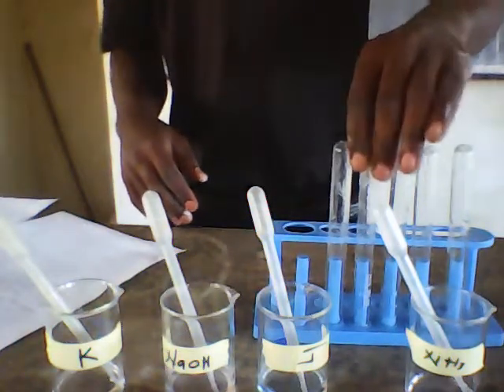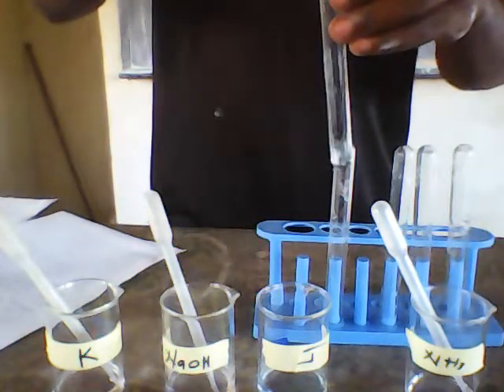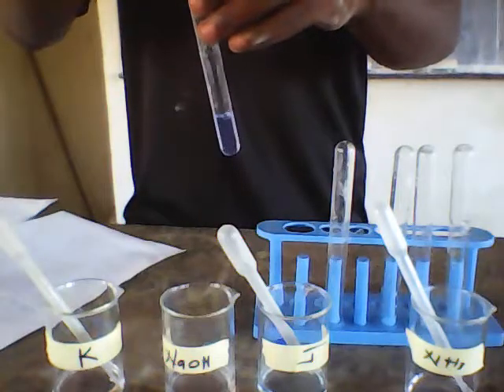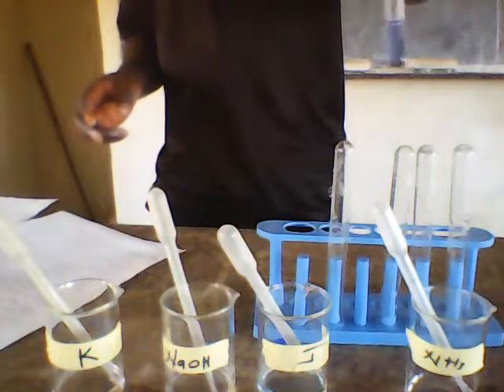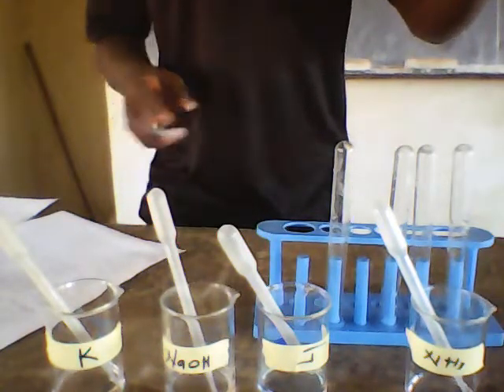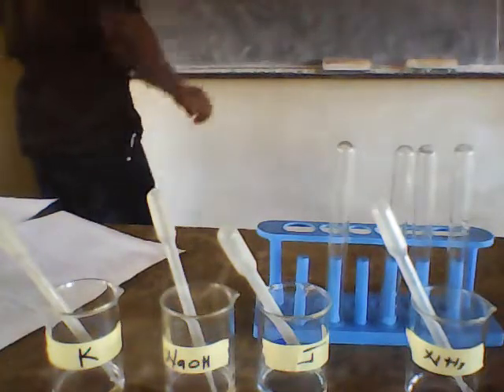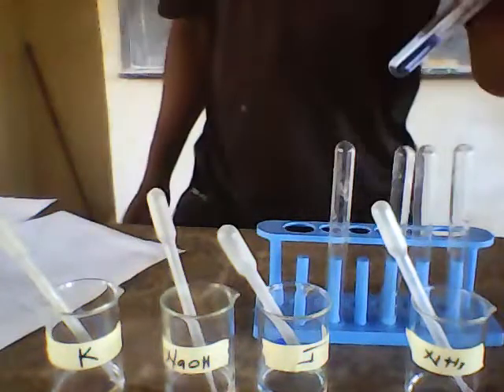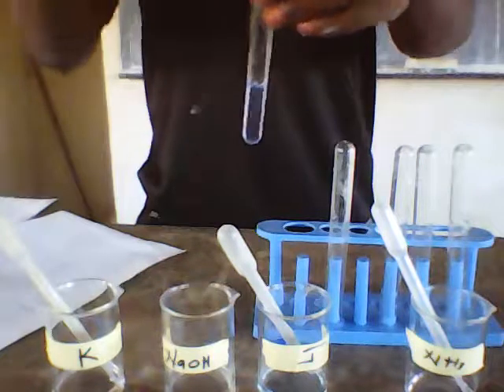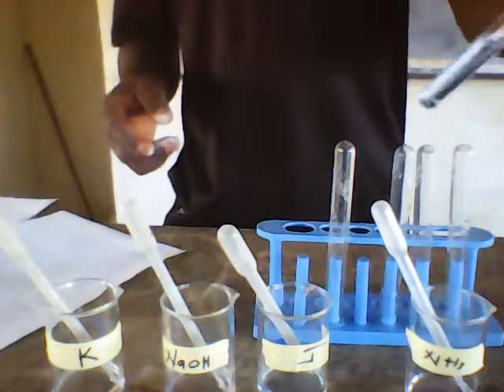To identify the cation present in solution J, I'm going to add a small portion of solution J into the test tube. Then I'm going to add a small portion of sodium hydroxide into the same test tube. This is what I'm getting: a blue precipitate. So I'm going to write my observation on the chalkboard. My first observation is that I have a blue precipitate, and I know that I'm supposed to add excess sodium hydroxide into the same test tube. So I'm going to add excess sodium hydroxide. As you can see here, my blue precipitate remains the same.